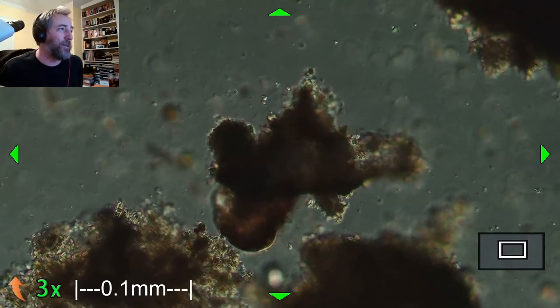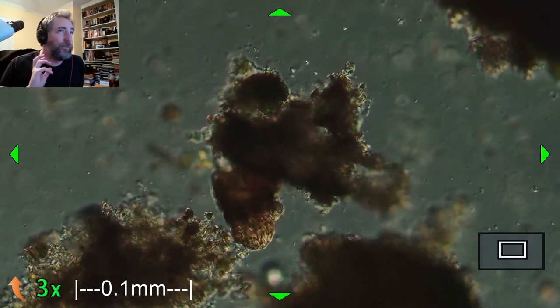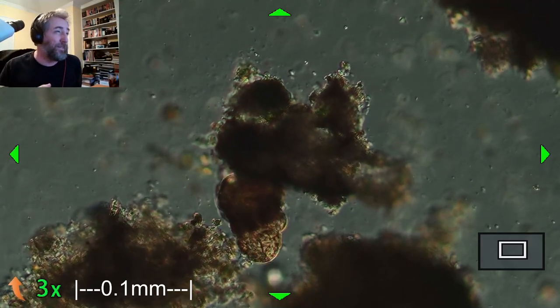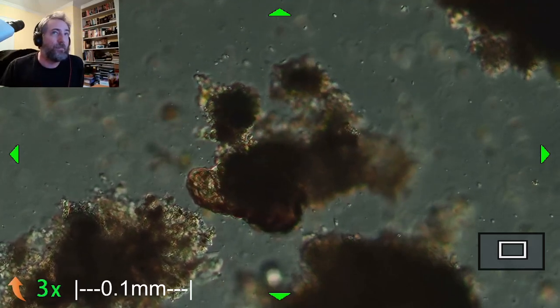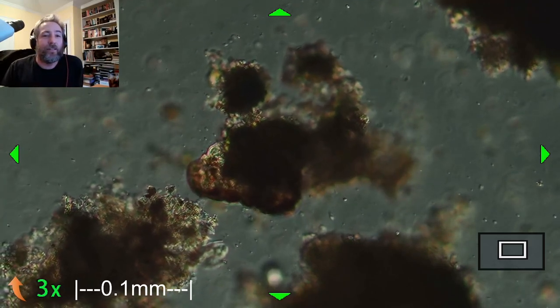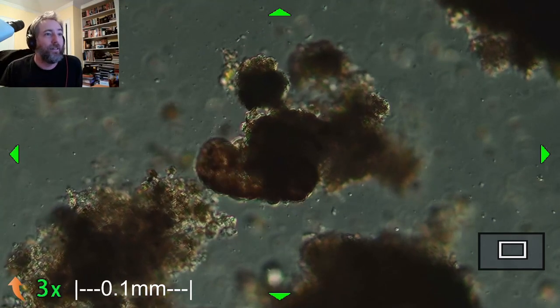But they have done experiments where they put some in their dehydrated states in temperatures about 300 degrees for about 10 minutes and then took them out and rehydrated them. And I think that a fraction of them managed to live through that.